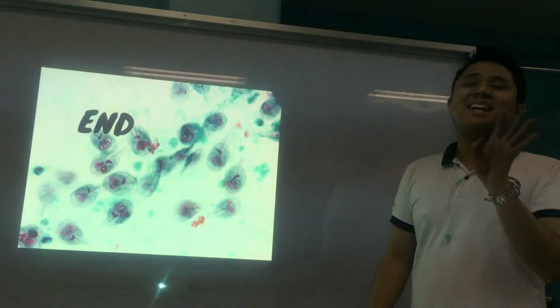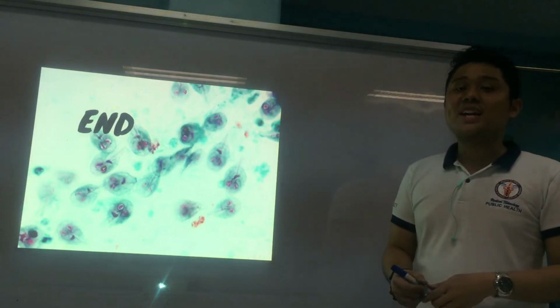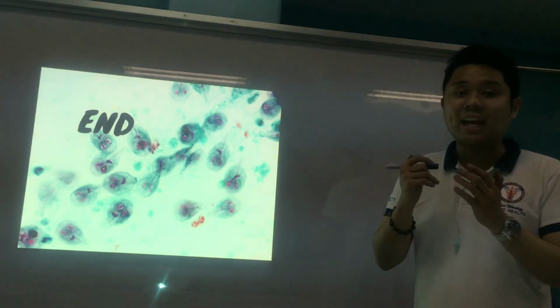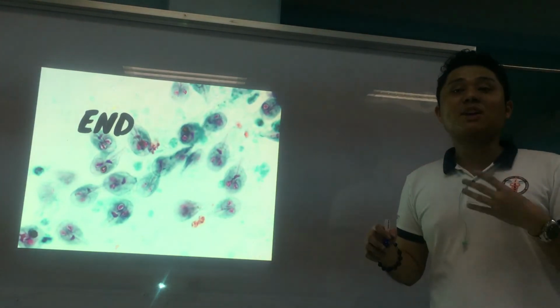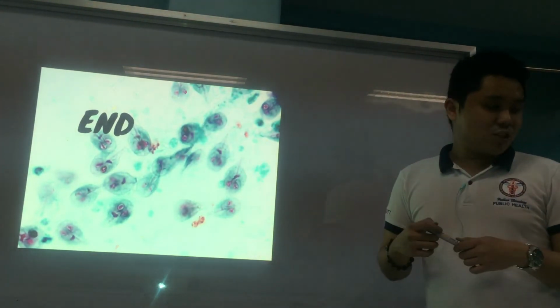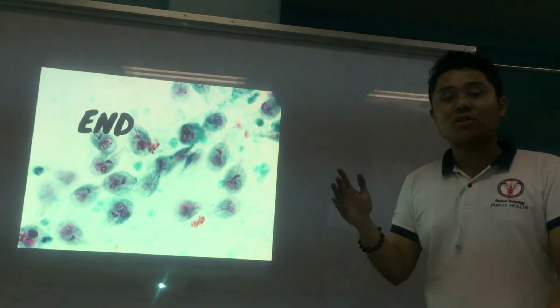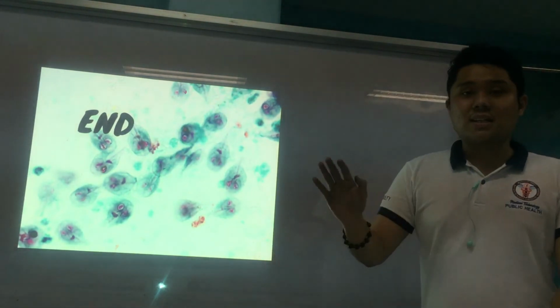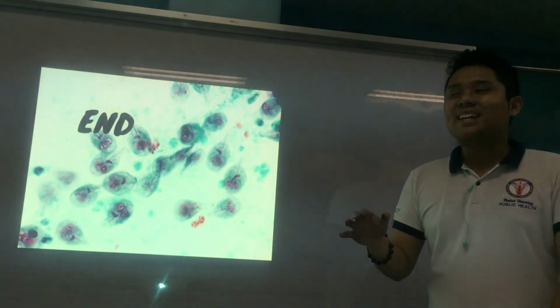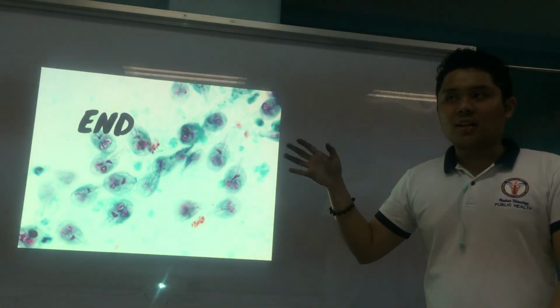That's the end of our lecture on the parasites that we can obtain from fecal smears. Quite lengthy, quite a lot. I know it's quite TMI, but I'm preparing you already for the information that you will get in the lecture. What I included here are just some of the nematodes, cestodes, and trematodes that we can obtain from fecal smears. In your lecture, you will discuss a lot more. What I included are just some of the most common ones na kita natin.